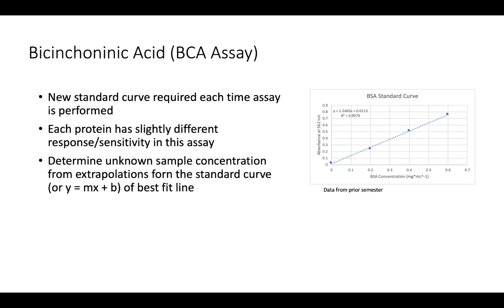Again, go through the lab manual, read and prep for this lab period. It will take you all of the lab in order to do your BCA assay. It's a reaction-based assay. You will be putting your samples into an oven or a water bath. They need to be at 40 degrees for about a half an hour. So there is a time piece in there. For the standard curve, you will need to set up your dilutions, so again, that will take time.